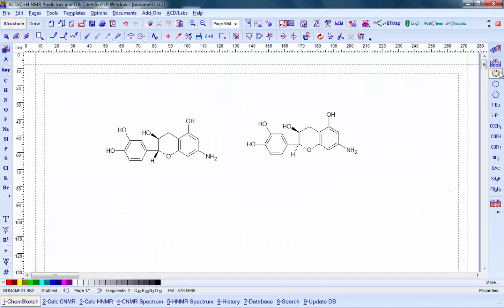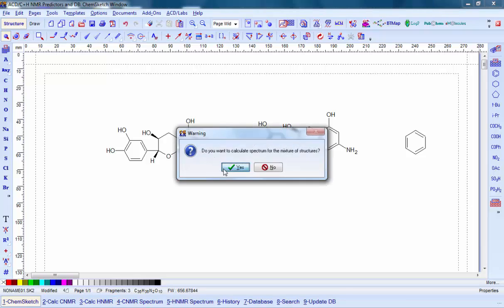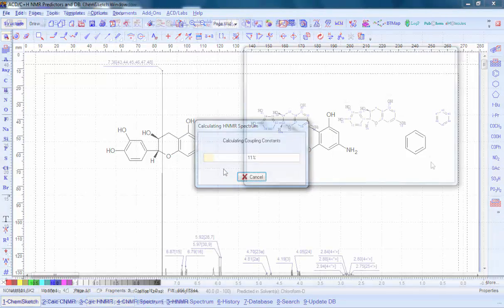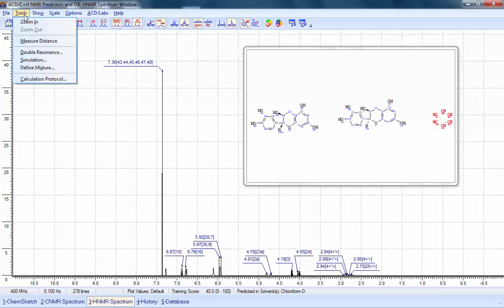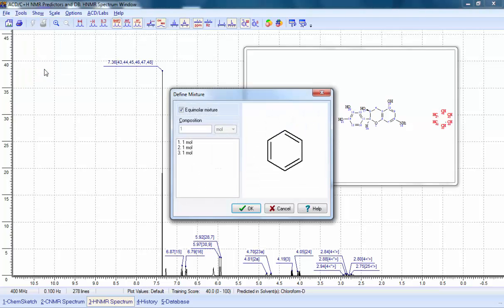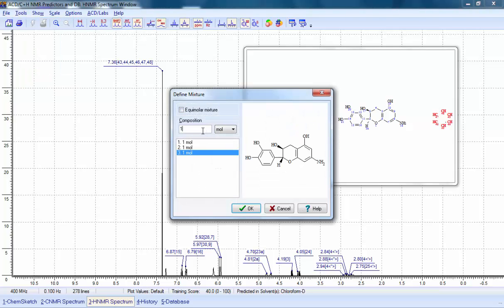We can make the mixture more complex, such as here with the addition of benzene. There is also the option to define the concentration ratios in your mixture, which will then be reflected in the predicted peak intensities.